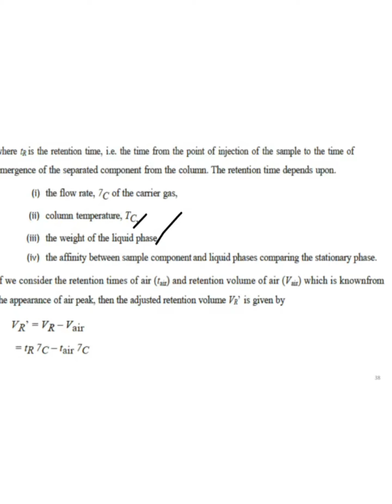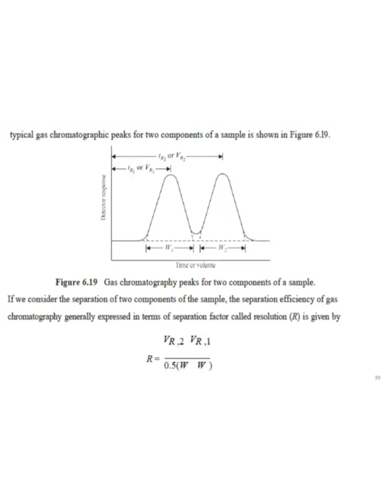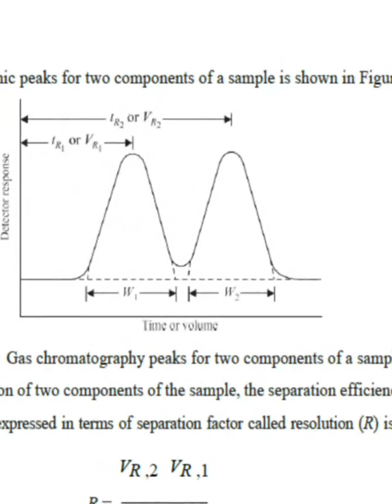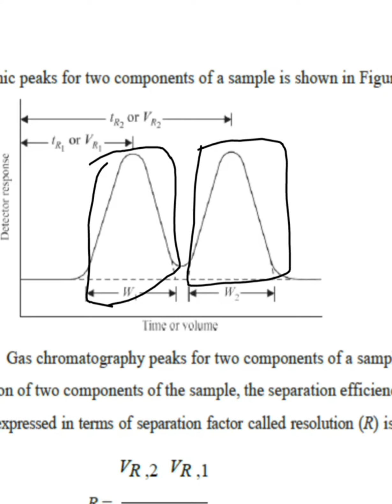This is the chromatogram from the gas chromatography, where this is the peak for one compound, and this is for another compound two.